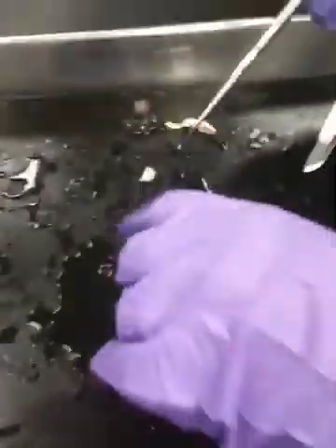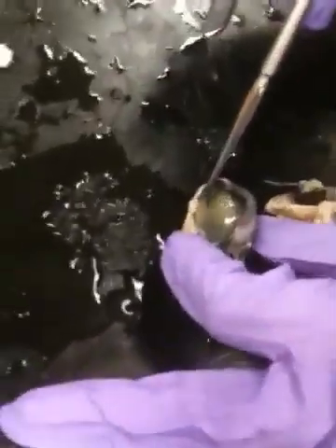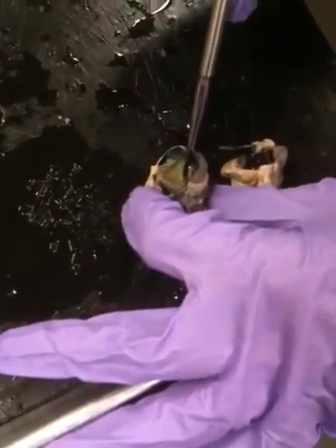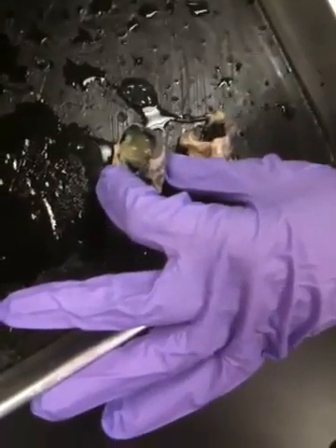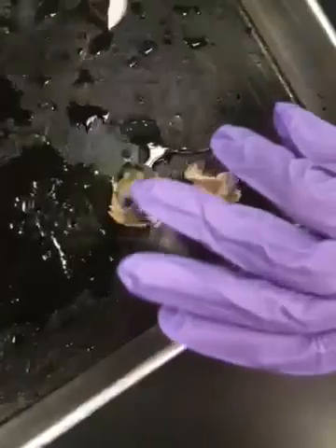Now, let's find the retina. The retina in sheepies, in us, is very, very delicate. It's this yellow layer. So we can very gently slide that back. Okay, and that is that. You can see there's nothing that attaches it to the underlying tissue. So that's why we have the vitreous humor helping to put pressure and keep it at the back of our eyeball. And you can see you've got all the snot there too.